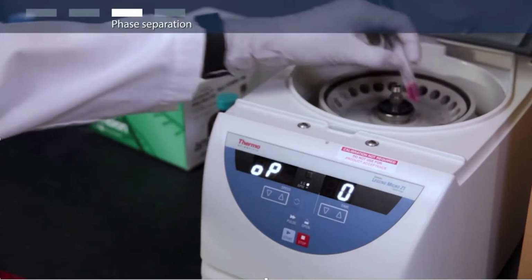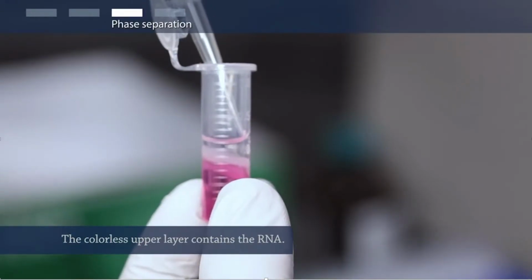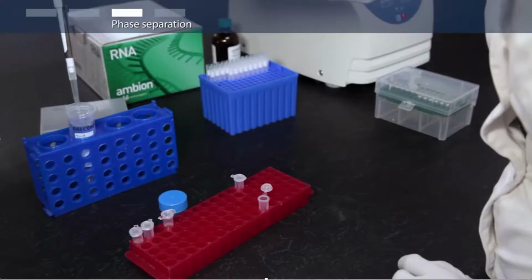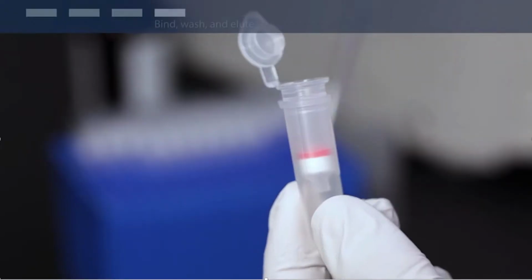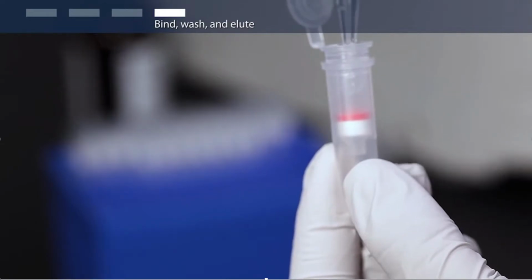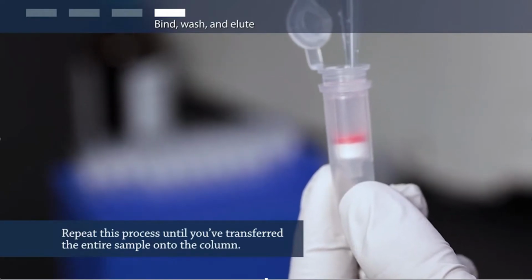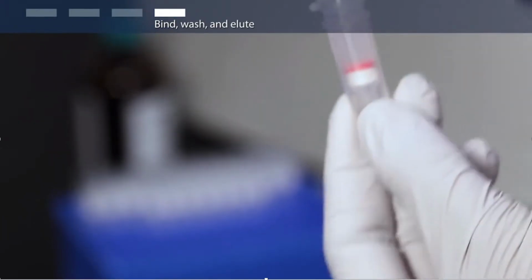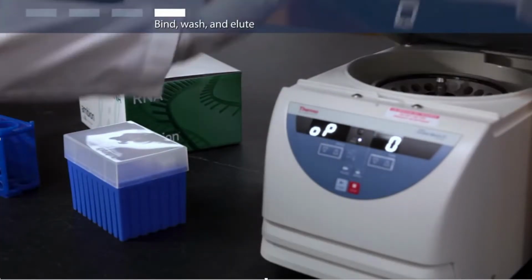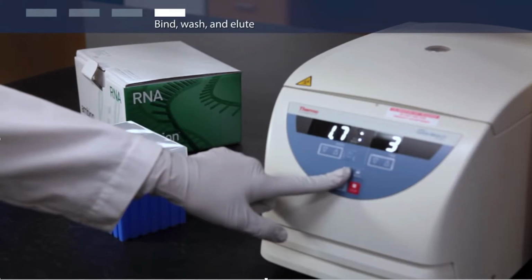You will see 3 different layers in the tube. The colorless upper layer contains the RNA. Transfer 0.4 ml of the upper layer to a fresh RNase-free tube and add an equal volume of 70% ethanol. Mix well by vortexing. Next, run your isolated RNA solution through a PureLink silica membrane column provided in the kit to wash away contaminants. Transfer 700 microliters of the sample to a column, which is then inserted into a 2 ml collection tube. Centrifuge at 12,000 g for 15 seconds. Discard the flow-through.